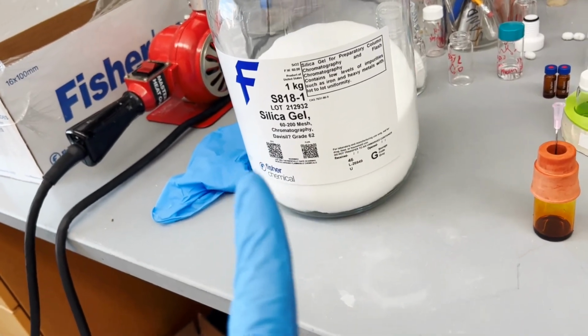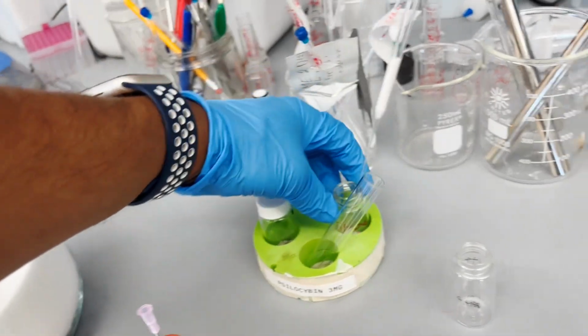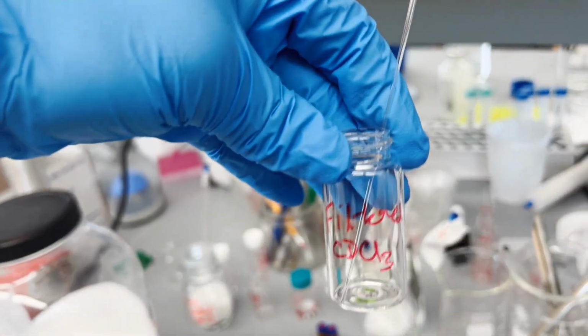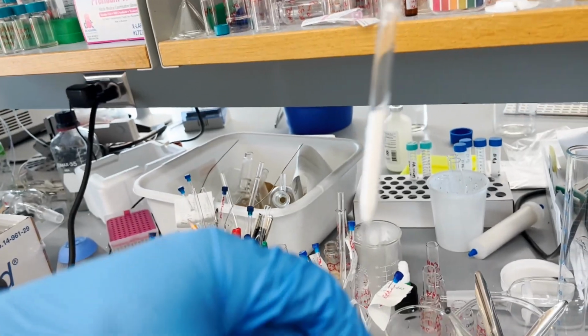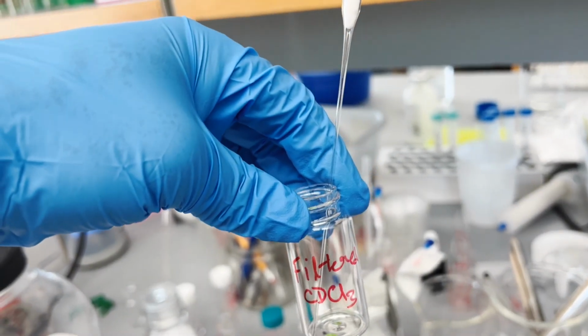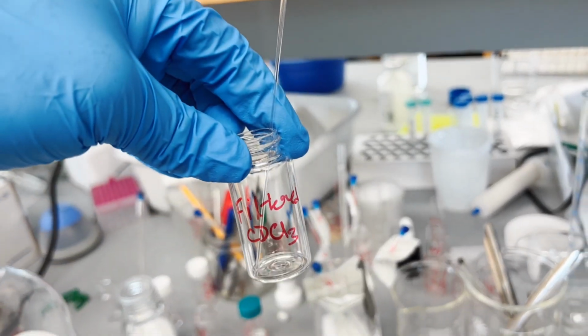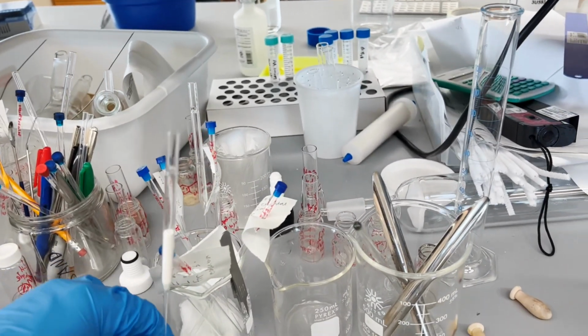So here is the silica gel. I'm showing that you should not use silica gel to purify these Schiff bases. As I told you about neutralizing the CDCl3, you can take some alumina in a pipette and then filter the CDCl3 through it into a vial, and it will be neutralized.